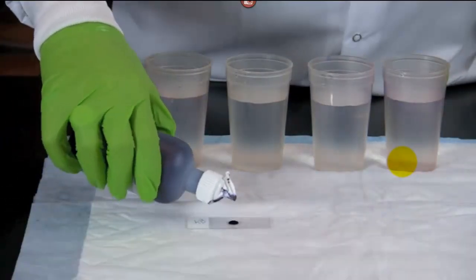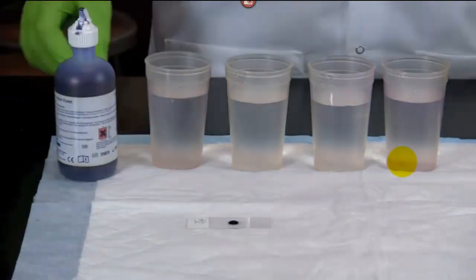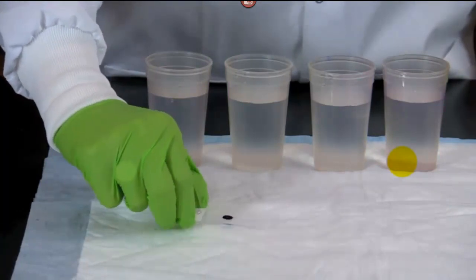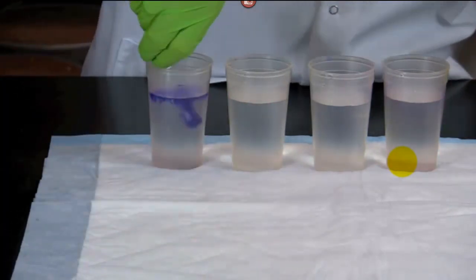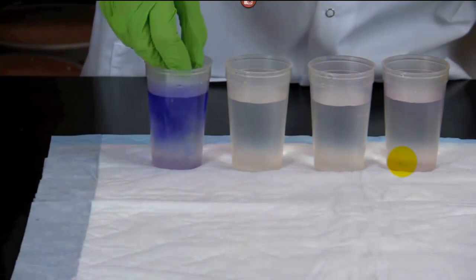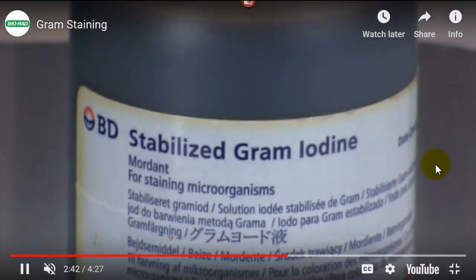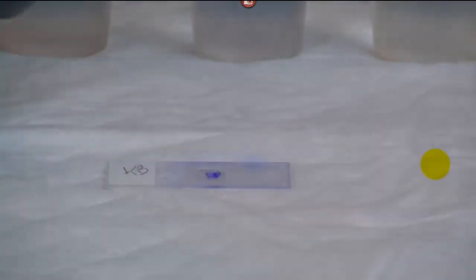We have little droppers, but just like that, and man, they're really making it very clean. You have to have water during this process, so you leave it on there a minute. Oh, interesting. So he's dumping it in there, and you can see, look, when he takes it out, you can see that there were some cells stuck to the slide, and they're purple.